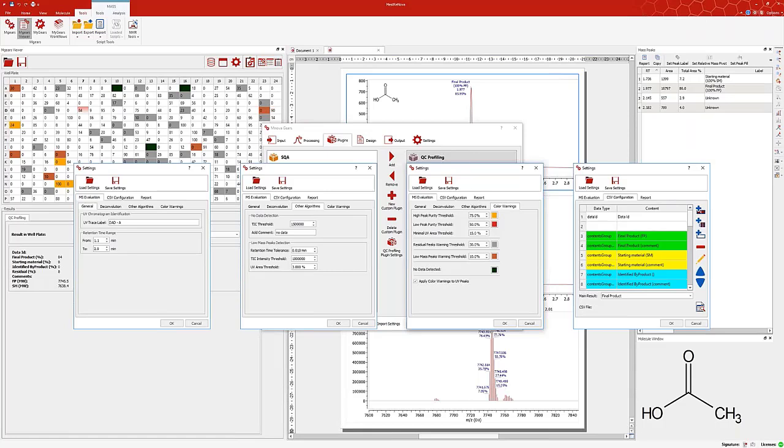For example, if the configuration of your input file changes, then you just save it under another name. Then every time you need to perform a certain application, you just need to reload the corresponding setting file by clicking on the button over here, and you know it will work.